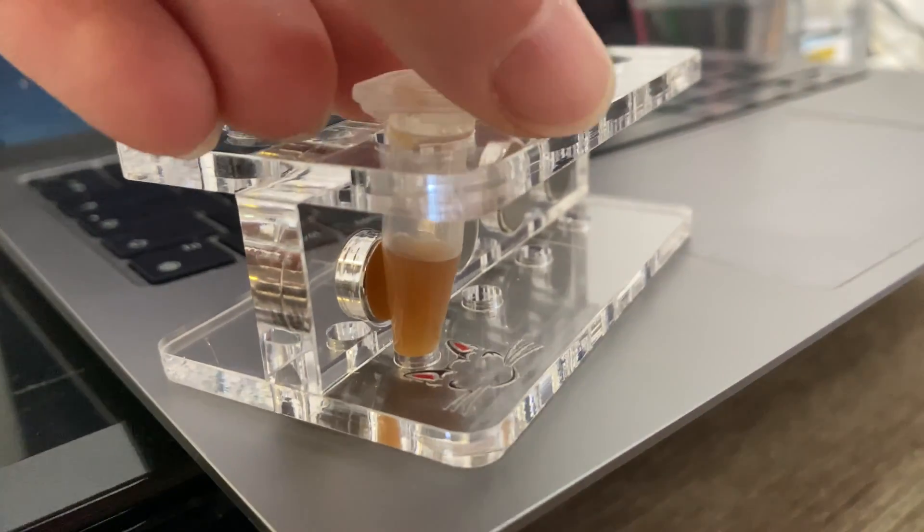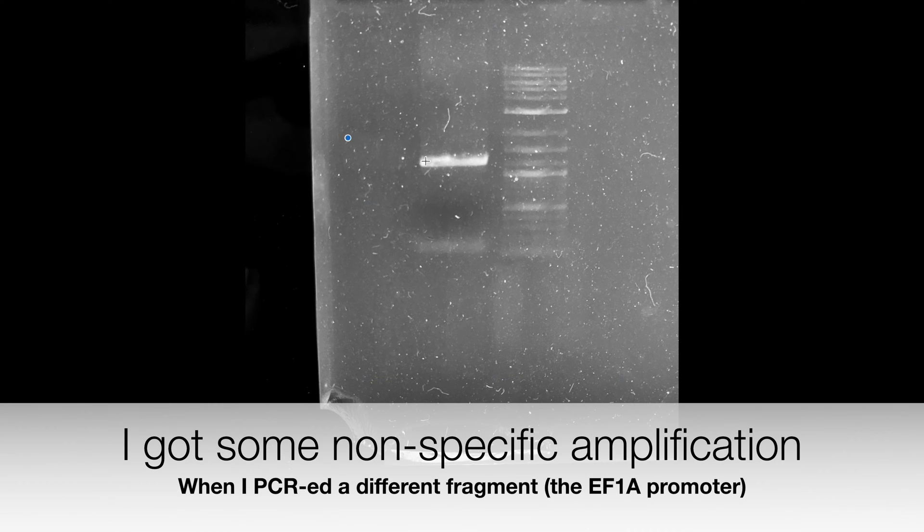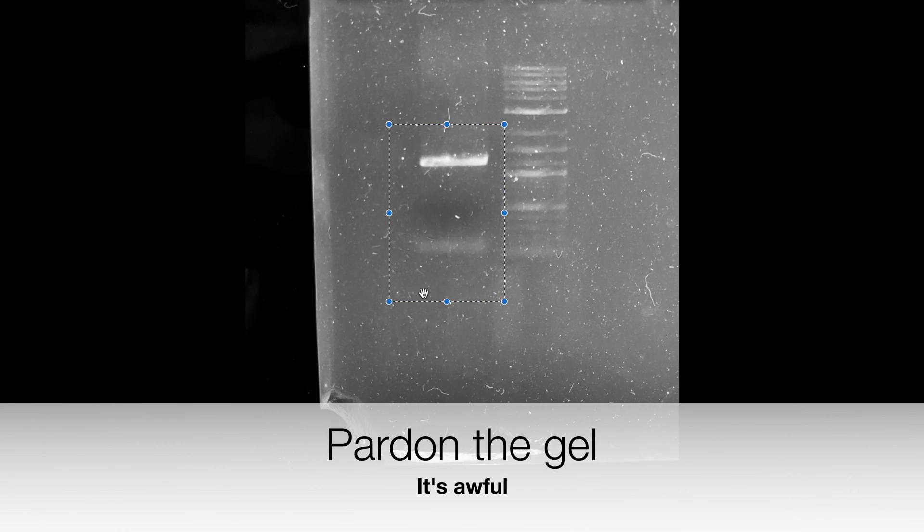I have two fragments: the correct one, but also this tiny fragment of about 200 base pairs. Because in cloning, small fragments tend to get cloned more efficiently than large fragments, I need to get rid of this small fragment before introducing the product into my cloning reaction. Let me show you exactly how you can do this.